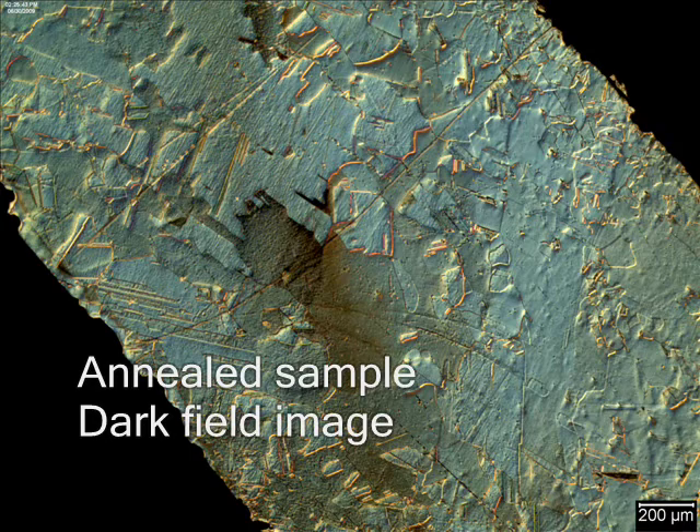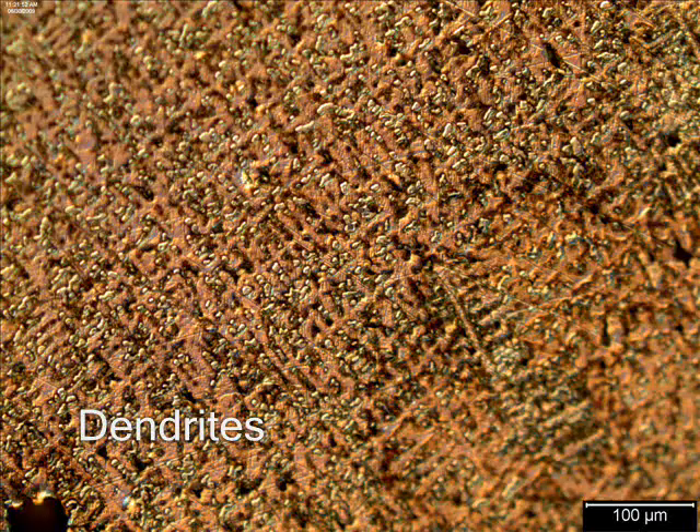Cold work samples can be annealed. The annealed microstructure has equiaxed grains, meaning that they are relatively circular. In dark field imaging the grain boundaries appear bright but the grains appear dark, the opposite of bright field imaging. Dendrites are observed in cast microstructures and are fern-like in appearance. They start at the outside of the sample and grow inward as the sample solidifies, exhibiting a preferred orientation. As a result of phase separation there are two phases in this brass sample.